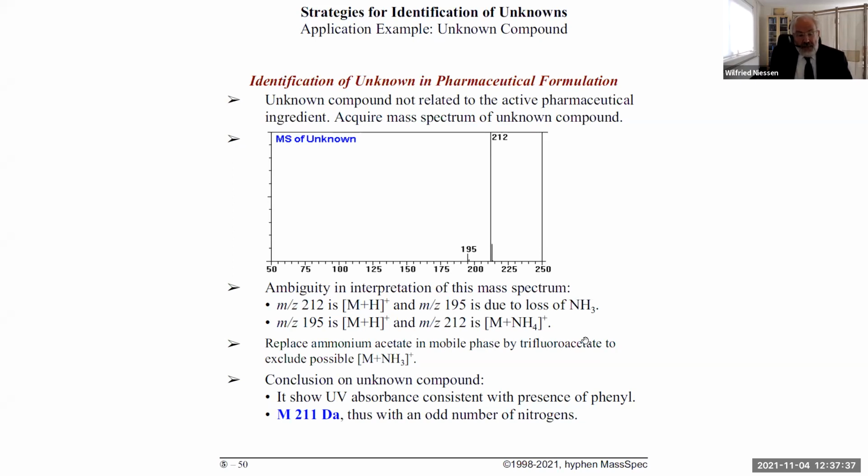And when I perform the experiment, why not inject in negative mode? No, I do positive ion mode. And of course, I don't do negative ion mode if I have TFA present. No, I'm talking about a normal injection without TFA, just to inject in negative mode to see if you still have the plus NH3 or not.